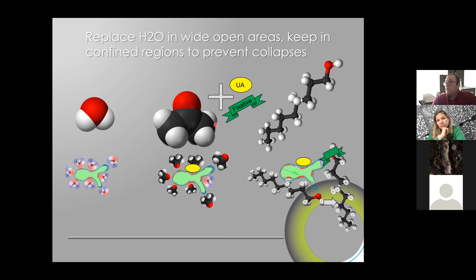Hopefully you'll have deposited some stain in the different areas of the molecules of the proteins you're interested in, and therefore you will start to gain some contrast. You increase the density locally so that the electrons will not go through too easily, and then you will gain some contrast in your TEM. It's not only the heavy metal salt that gives contrast. The proteins themselves also have a density and will slow down some of the electrons. So depending on your electron microscope setup, you will have some contrast even without contrasting agent, but it will be very mild.